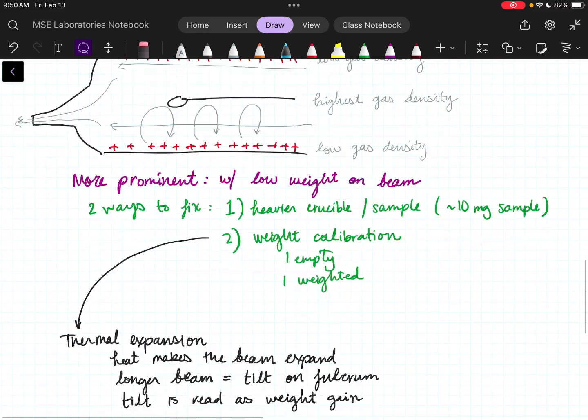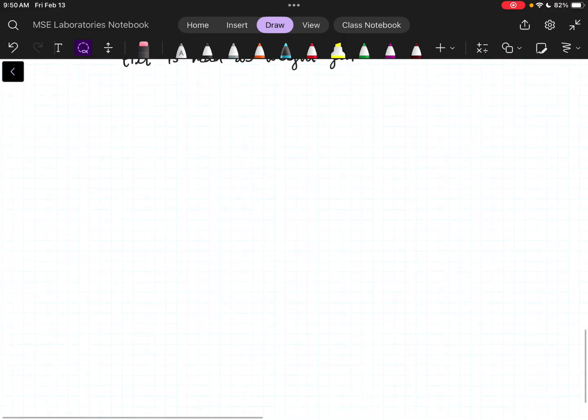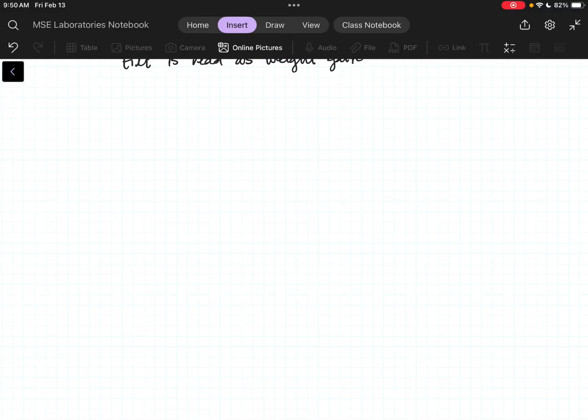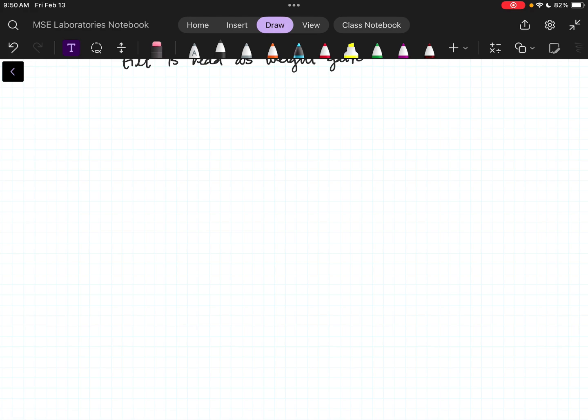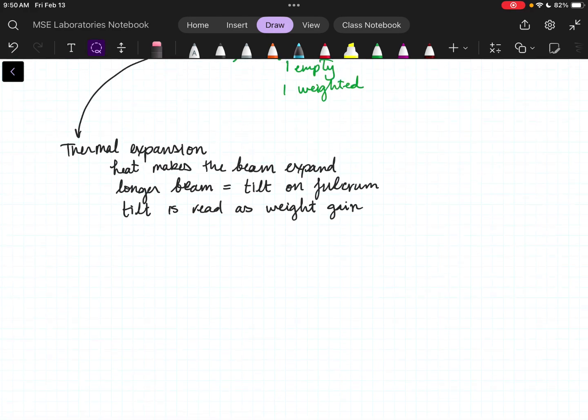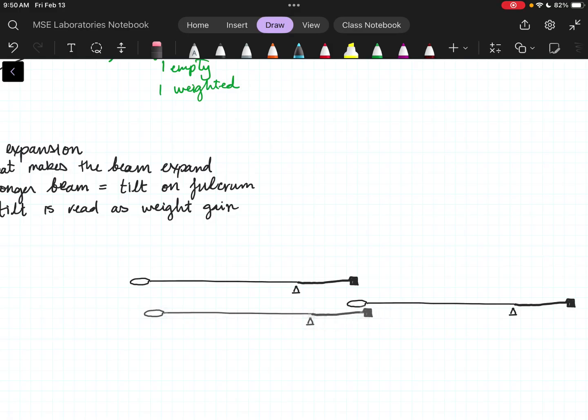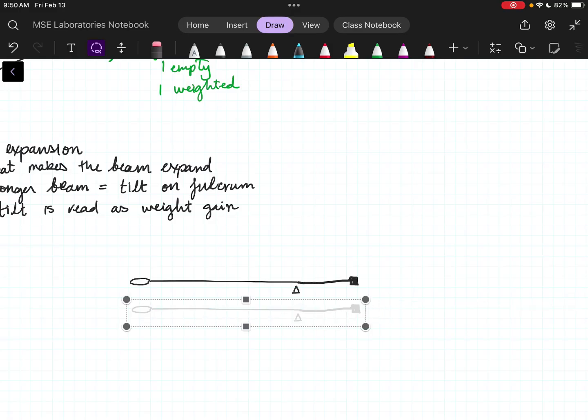This is where I was talking about the instrument reporting voltage values, especially when we're in a calibration mode. It reports just the raw voltage values so that we can double check that it's reading proper raw values, and then it converts that into a weight. So when we calibrate, we are calibrating the electromagnet, and then we turn that into a weight calibration.